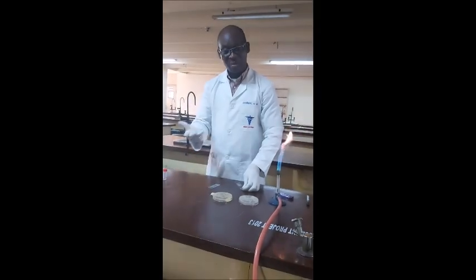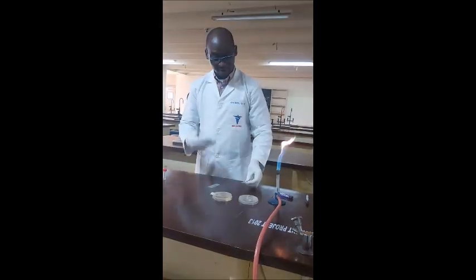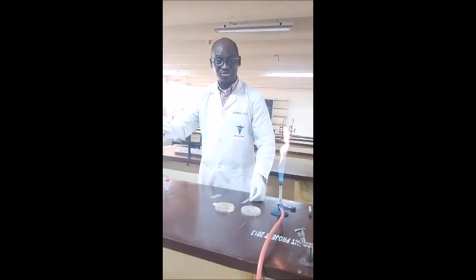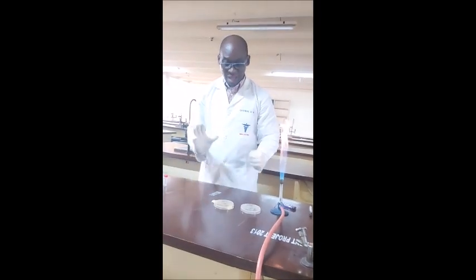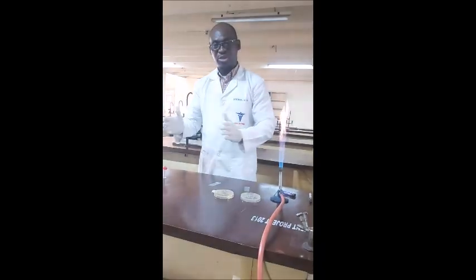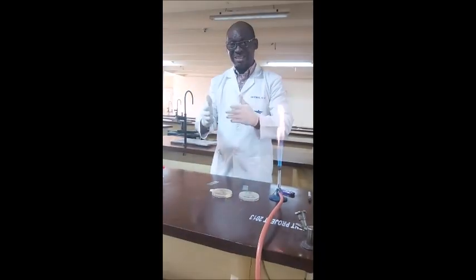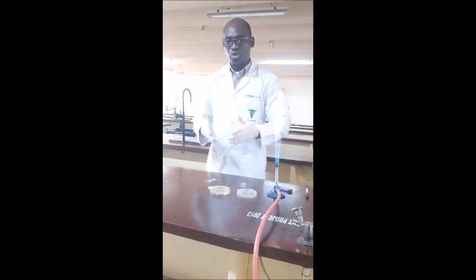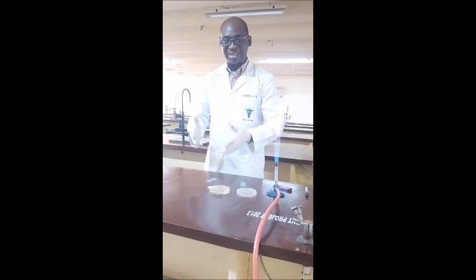Welcome back. From our previous class, what I described to you was the bacteria smear preparation. Now I want to take you into how we are going to stain the bacteria smear using the Gram stain technique.